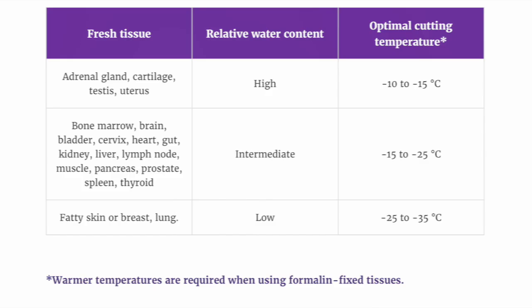It's worth pointing out that owing to the differences in water content between various tissues when fresh, this will affect the overall hardness of the tissue when frozen, and so it is often necessary to make slight adjustments to your cutting temperature. In the case of something like adrenal gland or cartilage, which has a relatively higher water content, you would use a relatively warmer cutting temperature, as compared to something like breast or fatty skin, which, having a relatively lower water content, will require a much cooler cutting temperature.